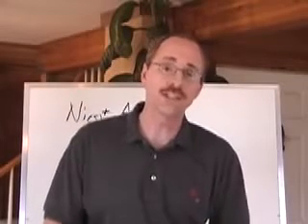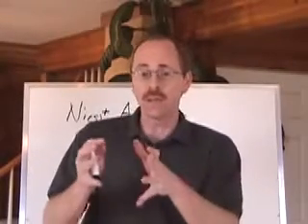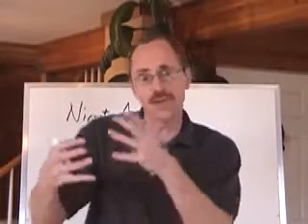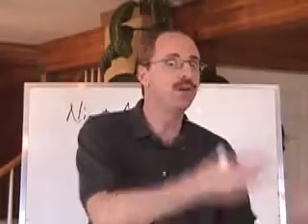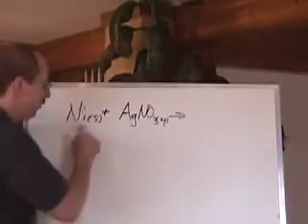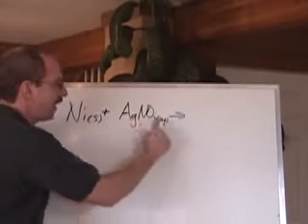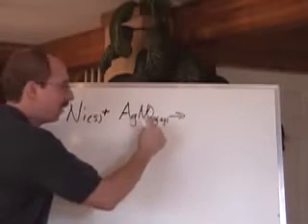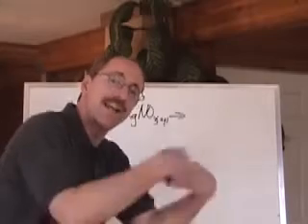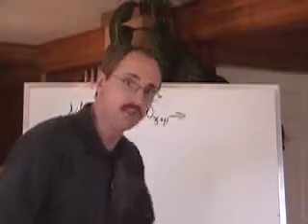These replacement reactions, single and double replacement, are when we take chemicals that are ionic in nature, put them in solution, and react them either with another element or compound to get a rearrangement of chemicals on the other side. Okay, here it comes. Watch this. Here's a piece of nickel, and we put it into a solution of silver nitrate. This is AgNO3, Ag positive NO3 together, and it's aqueous because it's in solution. I took an ionic crystal and I dissolved it to make a solution. AQ means aqueous, dissolved in water.